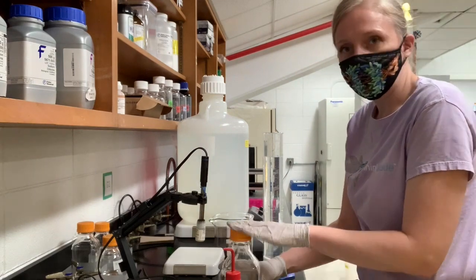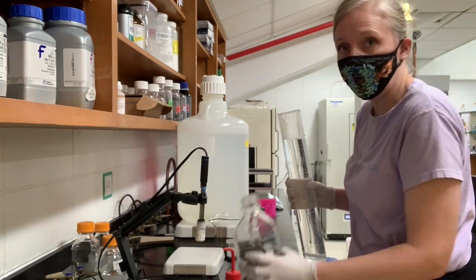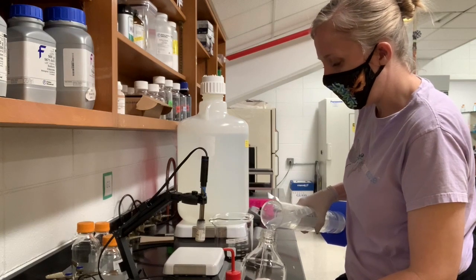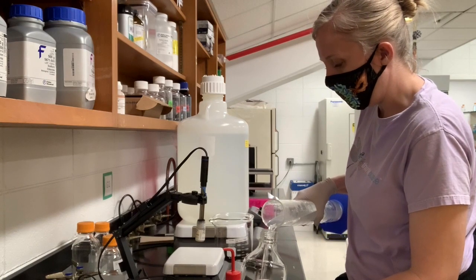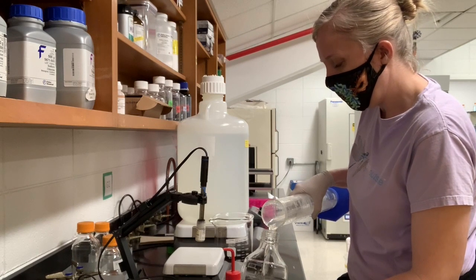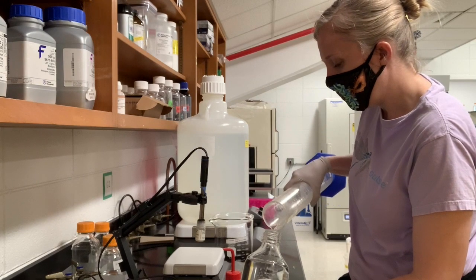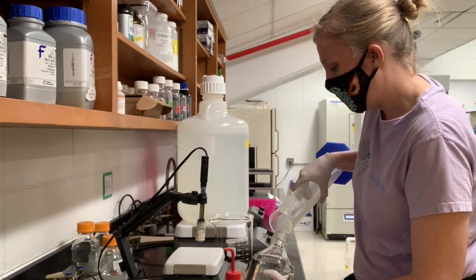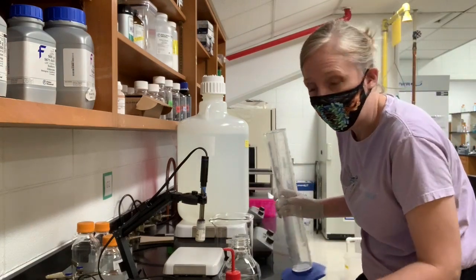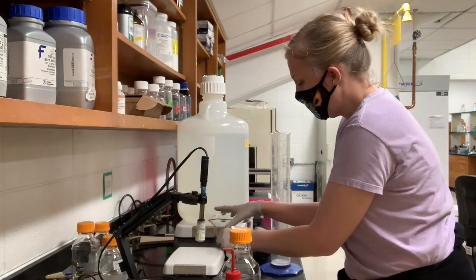So I'm going to take my solution and put it into a 1 liter bottle. Usually we use these bottles for storage, and also we can sterilize these bottles by autoclaving. And I mentioned that you can leave the magnet in the graduated cylinder, and the reason for that is we actually want a magnet in our 1 liter bottle because of the next step I'm going to introduce to you. So I put the solution into the bottle.